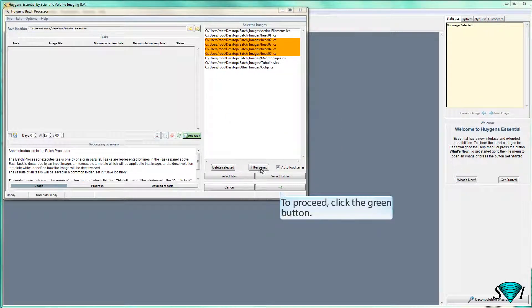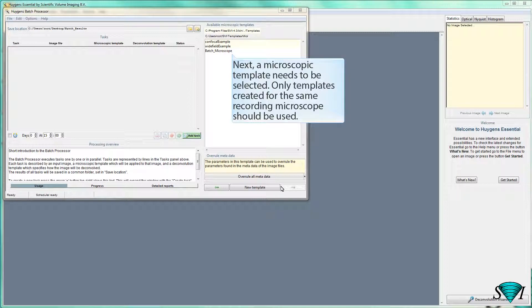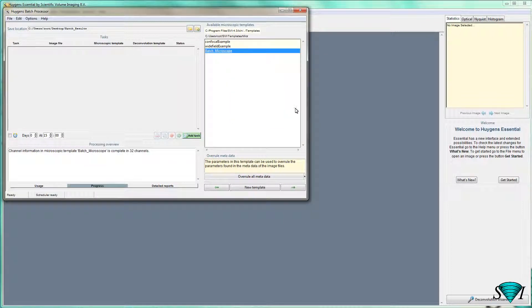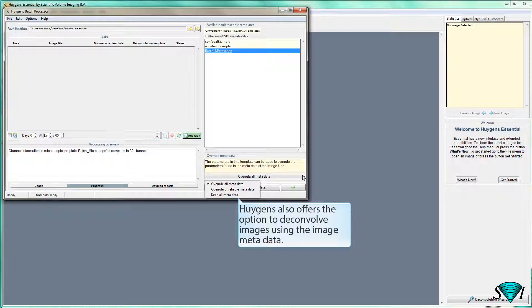To proceed, click the green button. Next, a microscopic template needs to be selected. Only templates created for the same recording microscope should be used. Huygens also offers the option to deconvolve images using the image metadata.